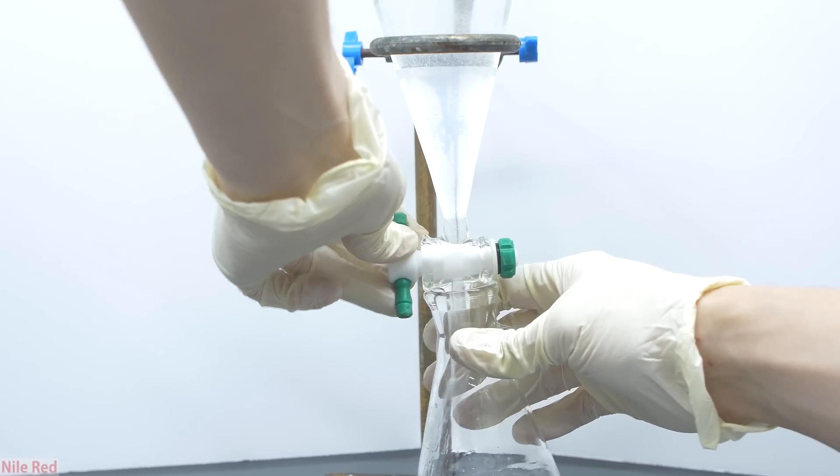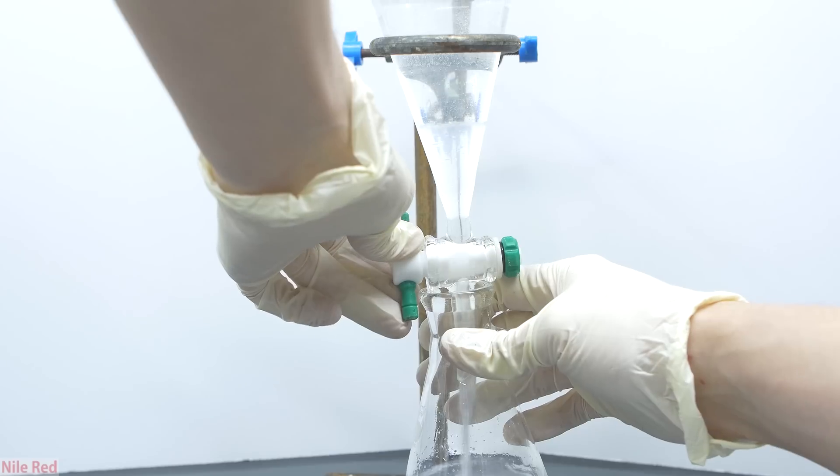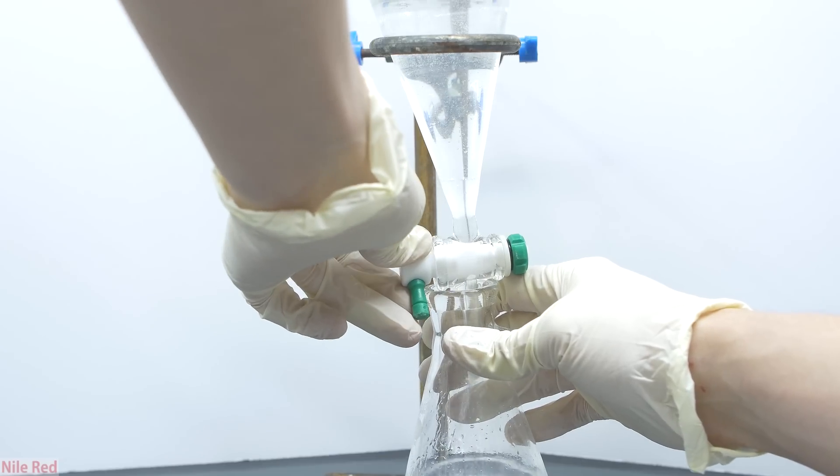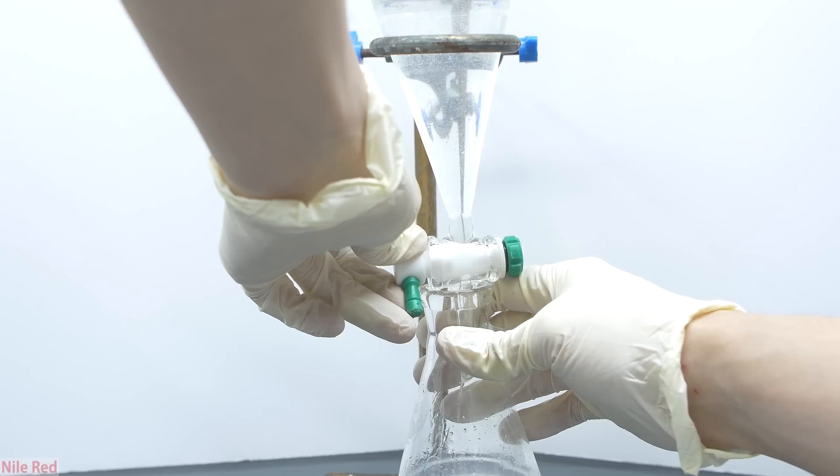Methyl iodide is much more dense than water and more dense than saturated sodium chloride solution, so it's the bottom layer and this is the one we want to collect and retain.